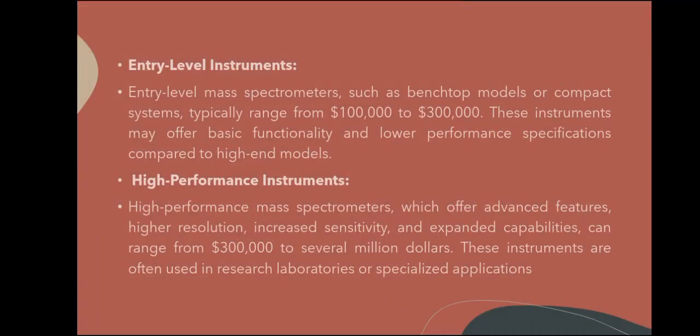Then high performance instruments. Spectrometers which offer advanced features, higher resolution, increased sensitivity, and expanded capabilities can range from $300,000 to several million dollars. These instruments are often used in research laboratories or specialized applications.